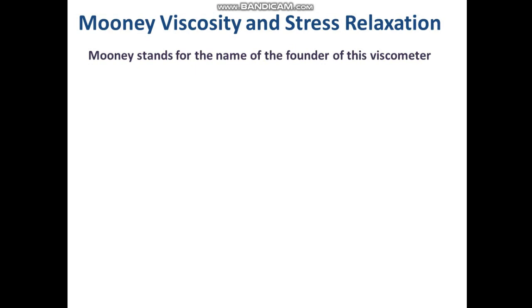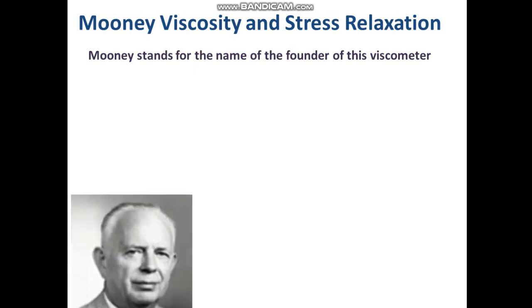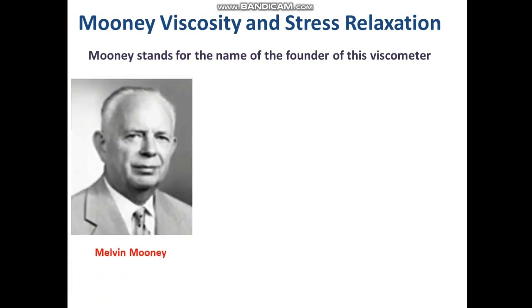The term Mooney stands for the name of the founder of this viscometer. He invented this Mooney viscometer, and out of respect for him, the viscosity of natural rubber is measured in Mooney units.